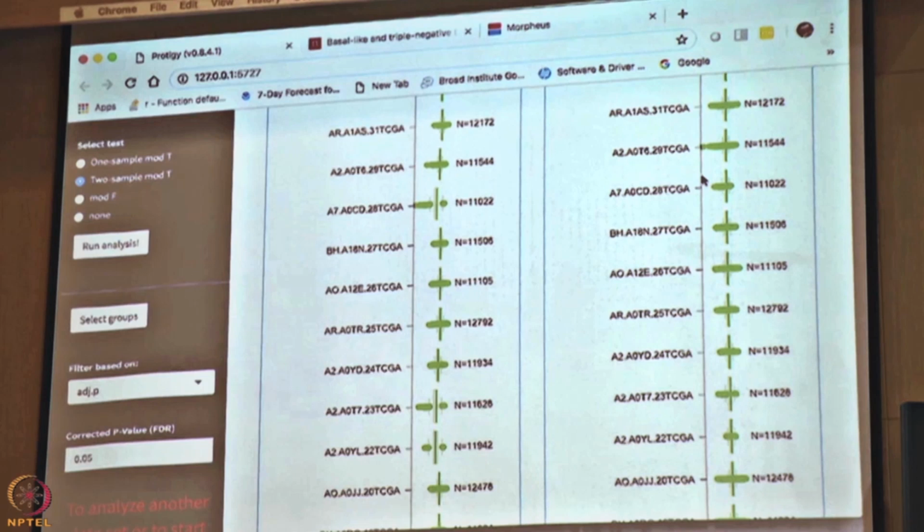So on the left side is the box plot before normalization. On the right side are box plots after normalization. I think the screen is so small, it's all squished. But you can see this sample was actually adjusted quite a bit to get to normalization, to agree with all the others. But the other samples were adjusted to a lesser degree.